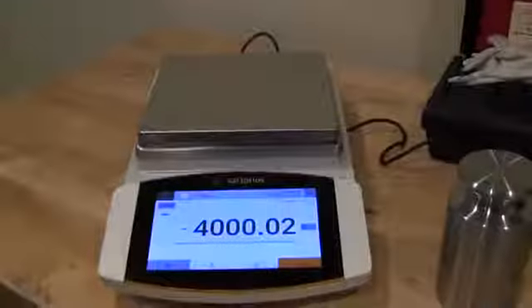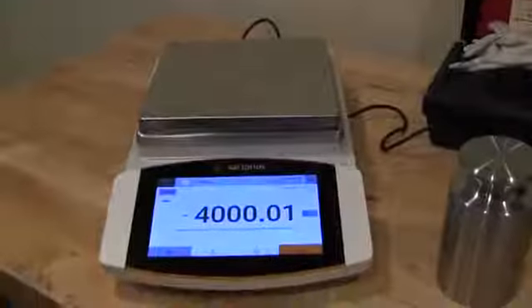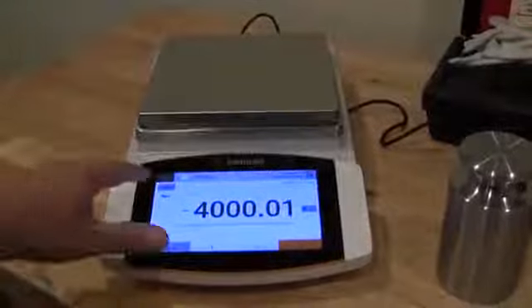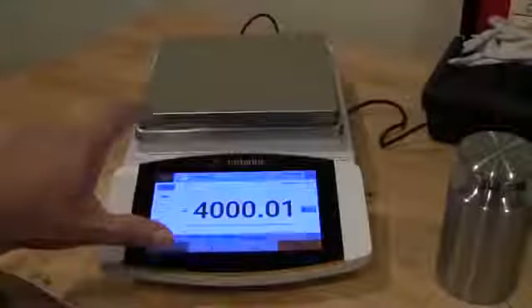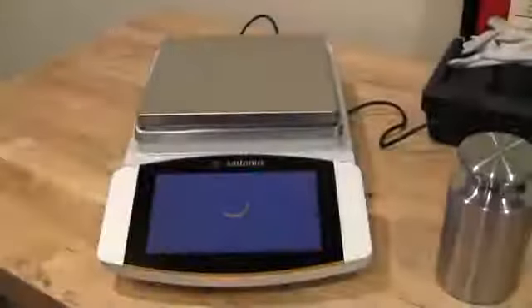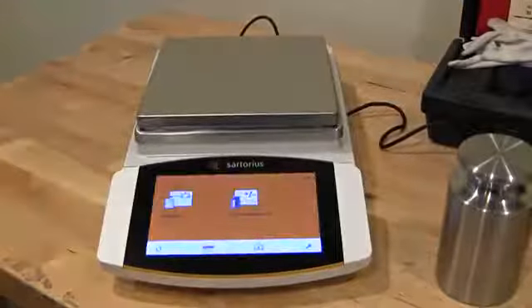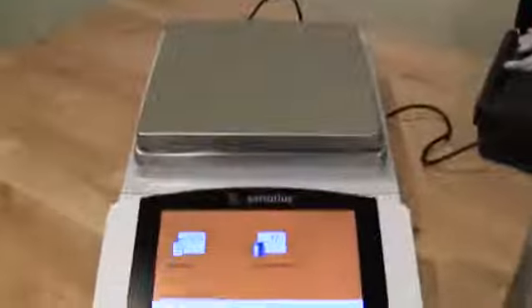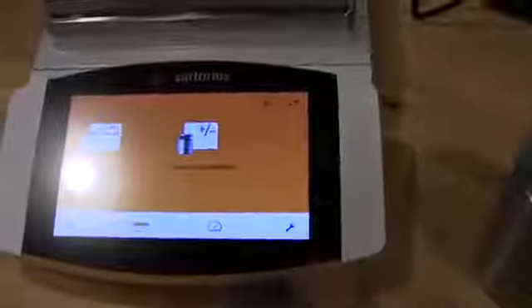Let me show you a couple more features on this balance. To shut it off. And so now in this menu we can go into this setup. If you wanted to change anything, you've got weigh default, weigh modes, and then it tells you all the modes that you have.